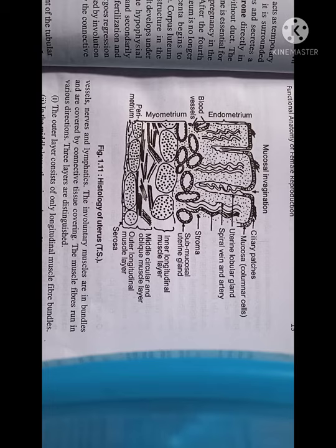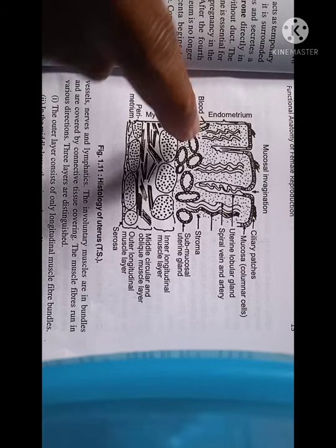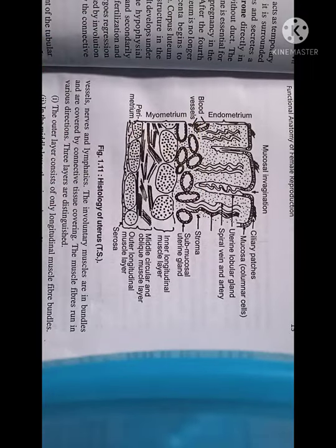The changing layer of mucosa is called the endometrium functionalis, and the region of the endometrium that remains unchanged, with no changes even during the menstrual cycle, is called the endometrium basalis. You see here, this is the endometrium functionalis, and this is the endometrium basalis layer.